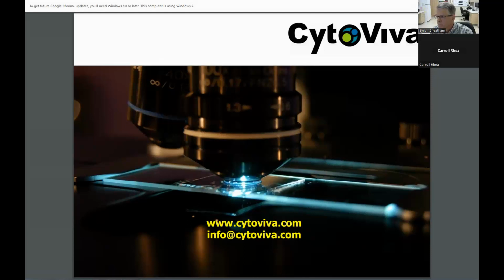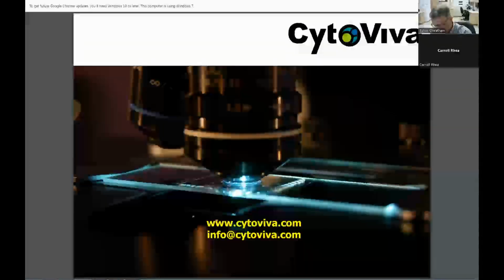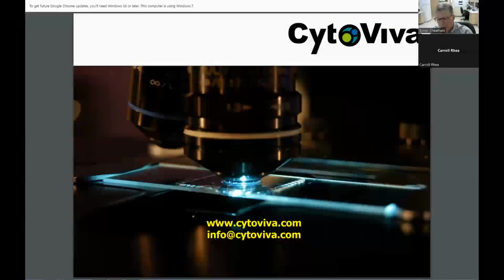Okay, thank you. Next, how do you dry the samples so that the nanoparticles remain static for the hyperspectral analysis? Well, that's a good question, and now we're getting in the weeds about sample prep. Nanoparticles do need to be stationary. If they're moving, in a line scan hyperspectral image capture, they would appear as streaks moving in the sample.